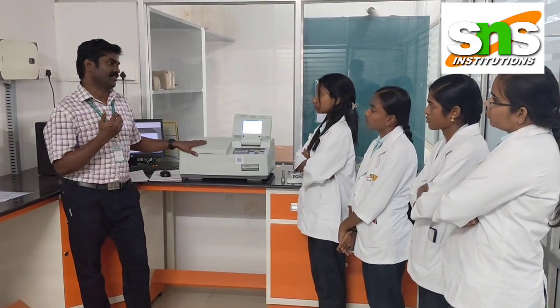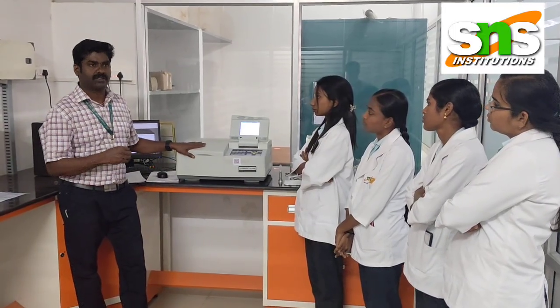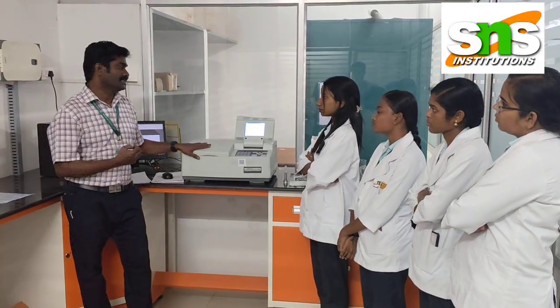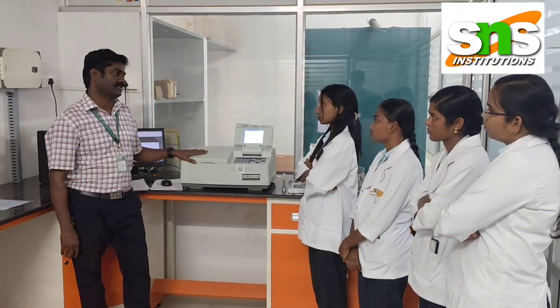Through absorbance, we can find out the concentration. Through concentration, after applying the dilution factor and everything, we can find out the percentage purity or amount present of different drugs.